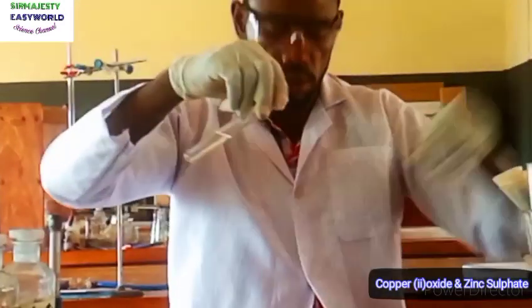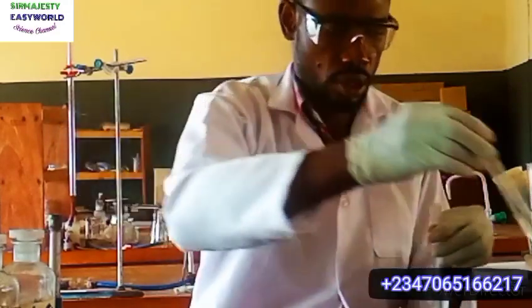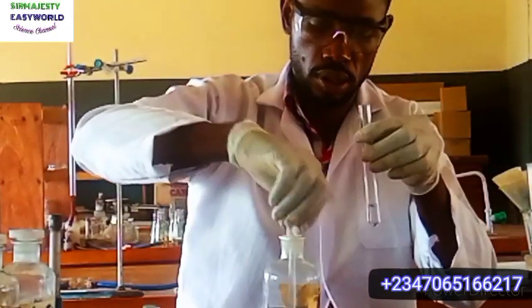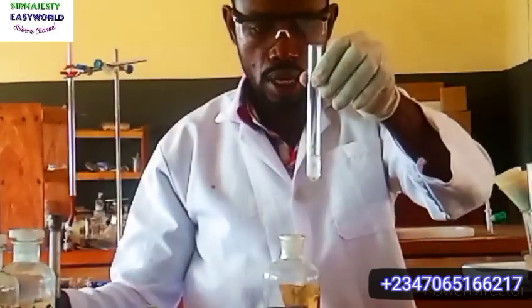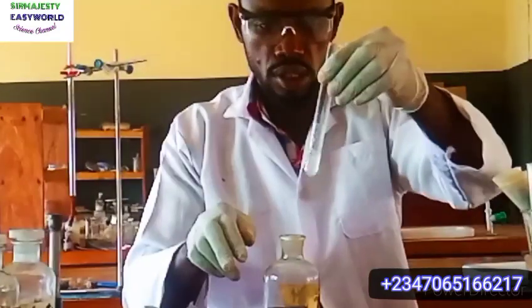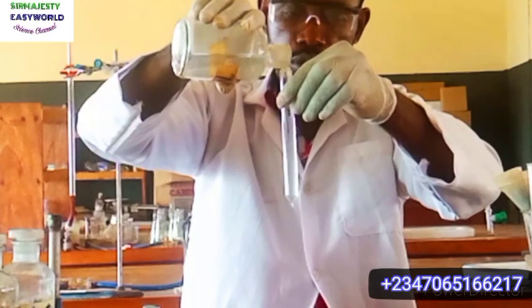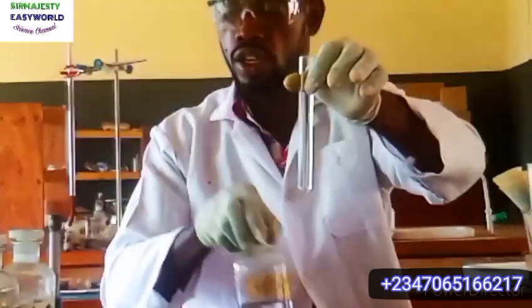So these are stock solutions. And I want to add the drops using the dropper. Yeah. So that's the precipitate, white gelatinous. It is sticky to the walls. Then in excess, the gelatinous precipitate will disappear and become clear. See the solution, the precipitate has dissolved to give us a clear solution.